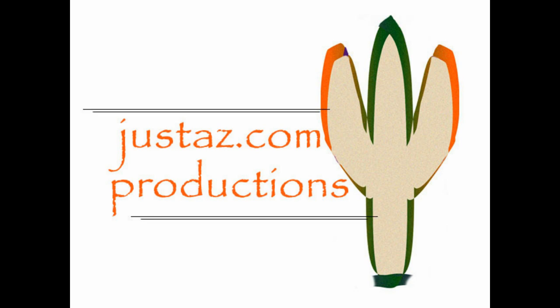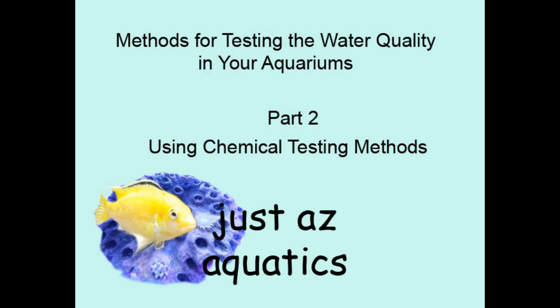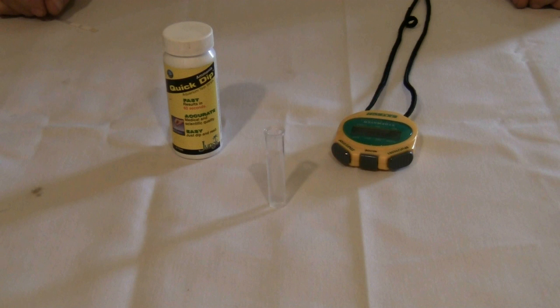JustAZ.com productions with JustAZ aquatics using chemical testing methods. Our first demonstration is the use of test strips to test for ammonia levels in our aquarium. Ideally you want no ammonia buildup in your aquarium as ammonia is toxic to fish.